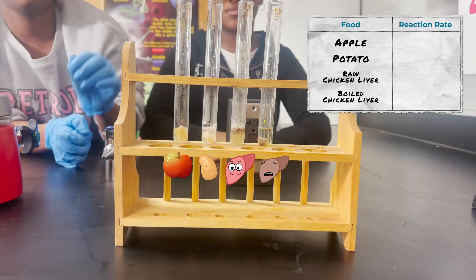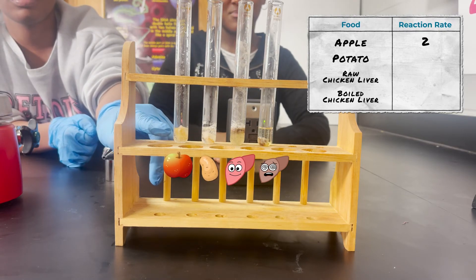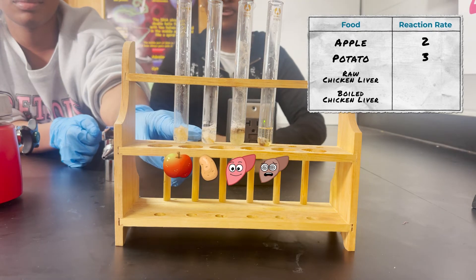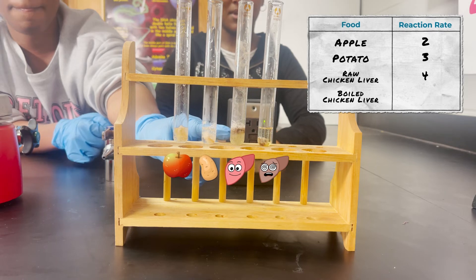All of these had a different reaction. The apple's reaction rate was a 2 because it has a few bubbles. The potato's reaction rate was a 3 because it has a little more bubbles than the apple and has a little foam. The raw liver's reaction rate was a 4 because it rose to the top and had a lot of bubbles and foam.